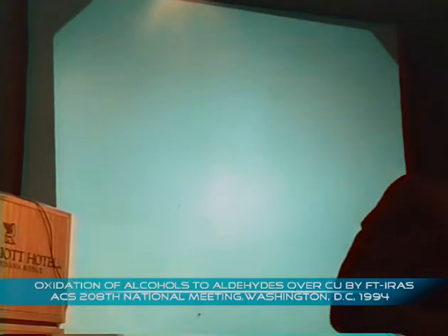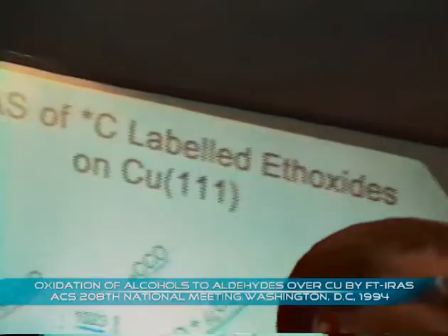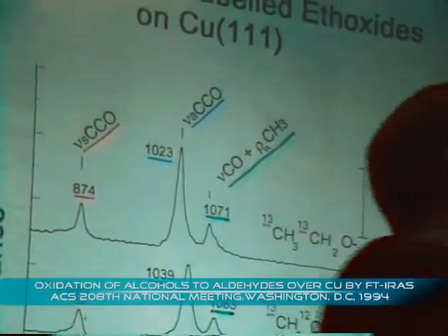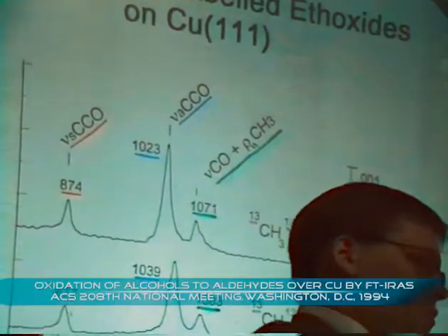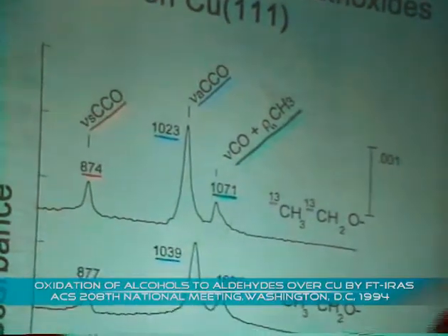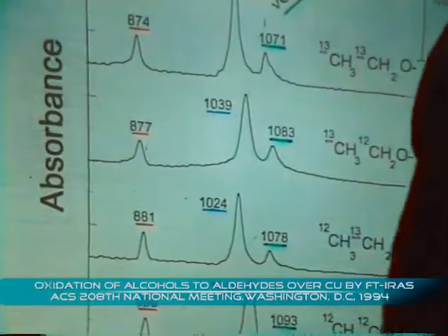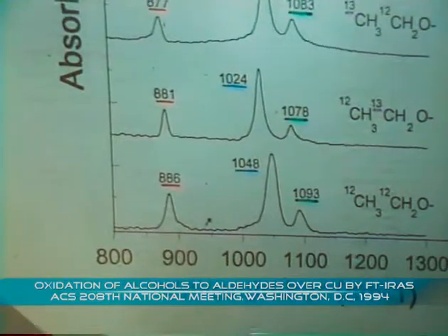Now, surface vibrational spectra of alkoxides have been taken before, initially, and still quite often in UHV, by electron energy loss. In those spectra, for the skeletal stretches, they usually identify two modes, around 850 and just below 1100. Those two modes are associated with the normal local groups, carbon-carbon and carbon-oxygen, carbon-carbon being the lower frequency.